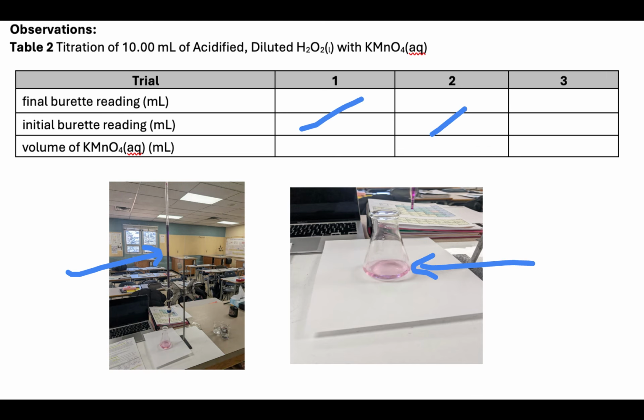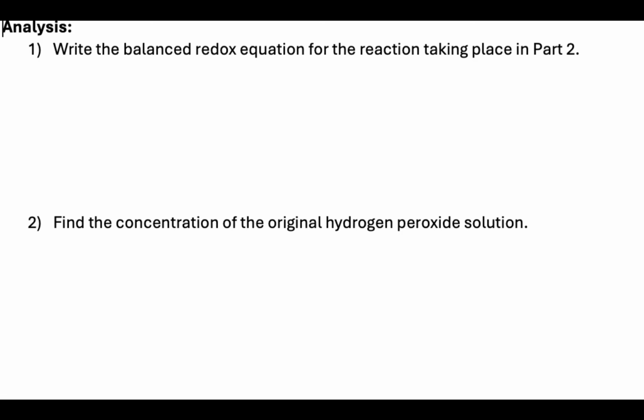Now, I'm just going to make up a value here. When I did my demo, we were around 12.1 mL. Of course, you'll do 3 trials. Hopefully they're all around the same, but that's what we'll use for our analysis.